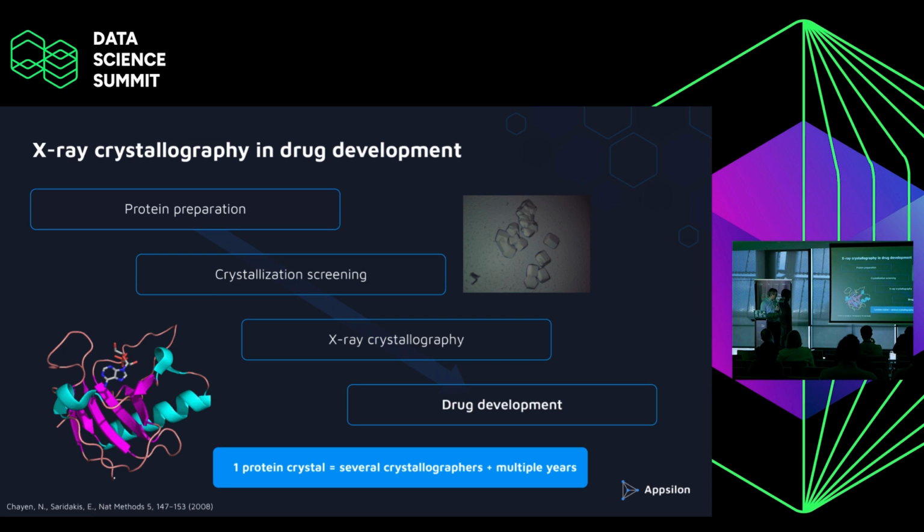So in particular, you can find quotes like several crystallographers can need sometimes up to multiple years, sometimes even like 20, to actually find a protein crystal that is useful for the given purpose they need. And that means, in particular, that at this stage of screening whether your proteins do crystallize or not, every crystal counts, which is a direct segue to recall, right? You do need as high recall as possible. Because if you're missing crystals at this stage, then your money went to air. So you're wasting a lot of time and effort and money.